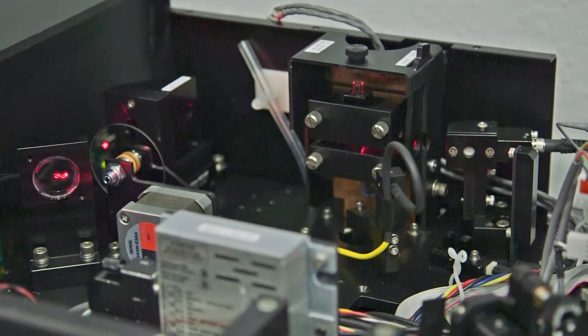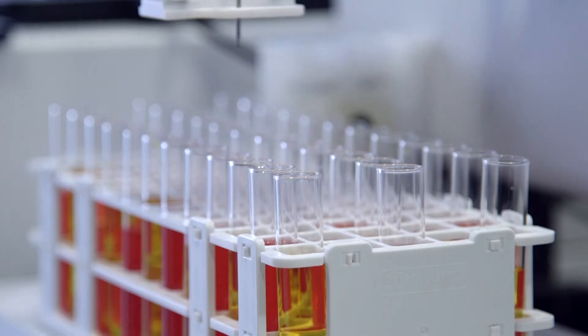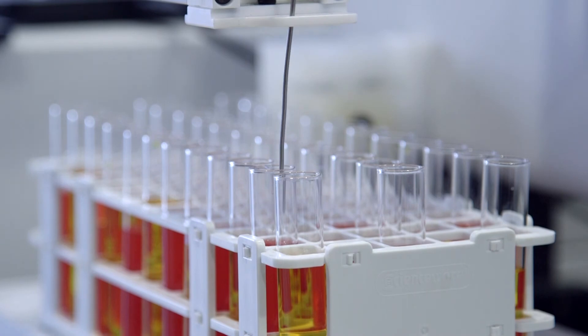The NICOP is the only benchtop multi-angle goniometer. Other unique features include auto dilution, an auto sampler, and the ability to measure DLS online in the process environment.